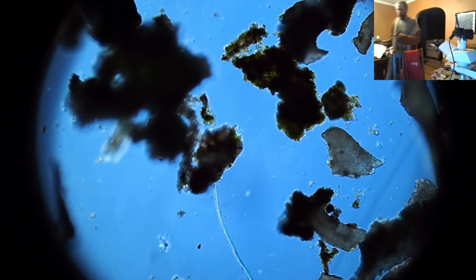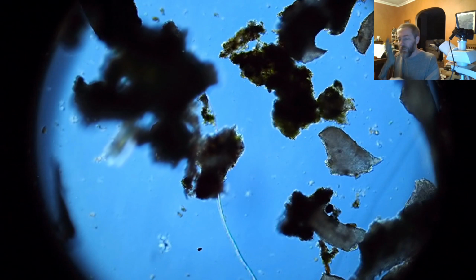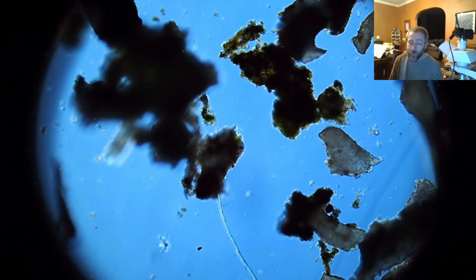This sample that we're looking at actually comes from this stick, so I should have had it with us. It's a little harder to see the lichen. It's kind of this white stuff in here. It's pretty similar to the type that's on that bark, but the tree type is very different. So you can see that it's got this sort of rough textured bark. It doesn't seem to matter.